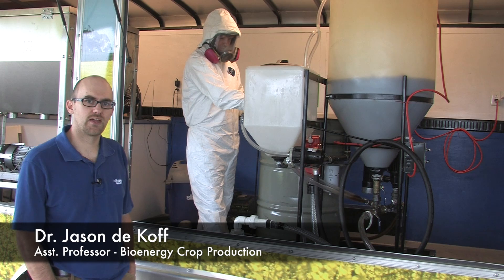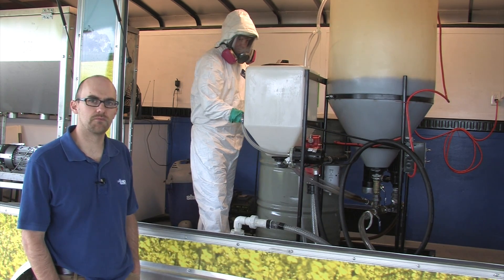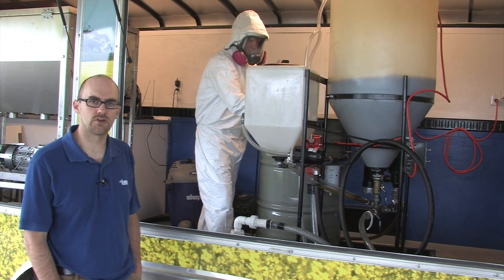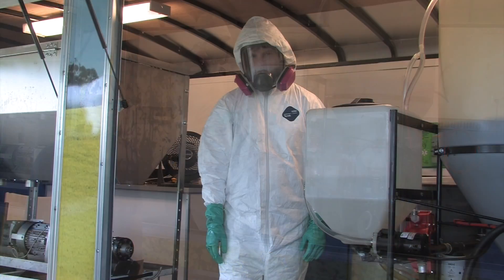My name is Jason Nikoff and I'm with Tennessee State University. In this segment we're going to be making biodiesel based on the oil that we pressed previously and also the titrations that we did in the laboratory.